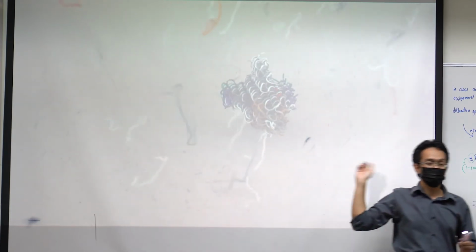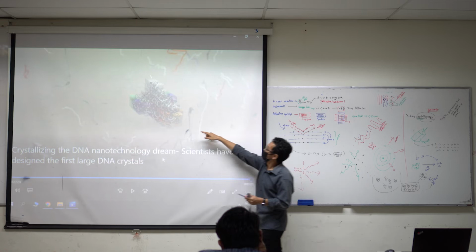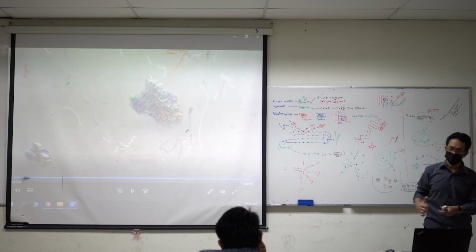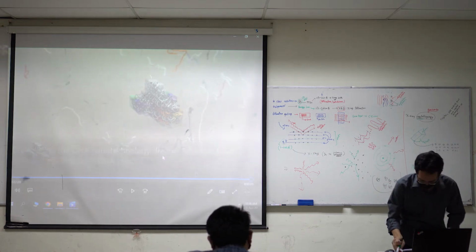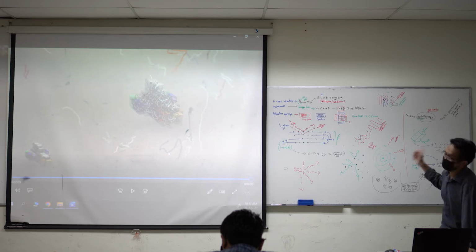So by having this pattern, only then can you use XRD to shine. You create the lattice there, and from that you can study it under X-ray, X-ray crystallography. So that's why, in order to use X-ray, you need to make it a crystal first.